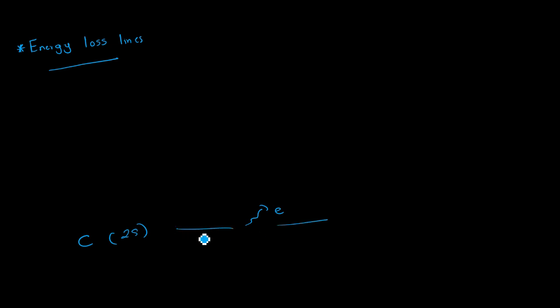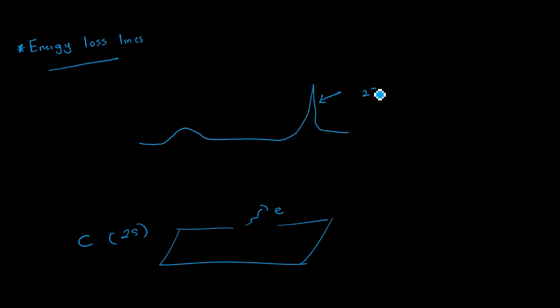So this is basically the surface. When electrons are emitting, the surface also consists of atoms, right? So these atoms have an electron density. These emitting electrons can interact with these other electrons on the surface, or maybe in the environment. Due to these interactions, there will be another peak. We call this a hump peak. This is our original peak relative to the carbon 2s electron. This we call a small hump. You can see it's a broad peak because of this interaction. It's not a narrow peak.